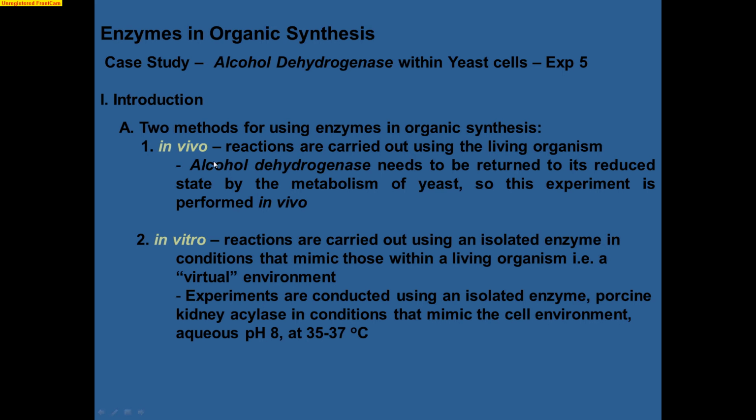That is not what we're going to do. We're actually going to do these reactions in vivo. And the way that this occurs is that the substrate that we're using, this ethyl acetoacetate, is permeable through the cell membrane. So ethyl acetoacetate can pass into the yeast cells and can be reduced inside of the yeast cells. So the actual method that we'll be using is in vivo.